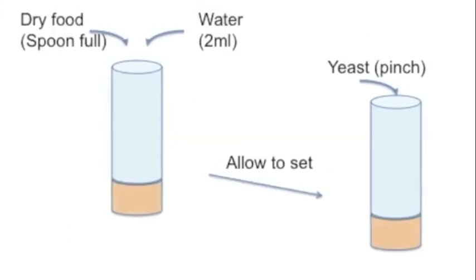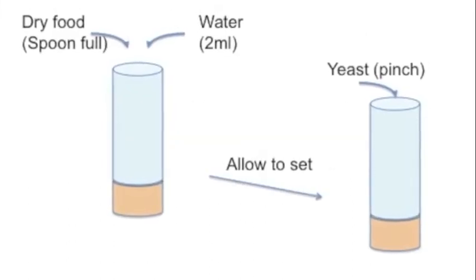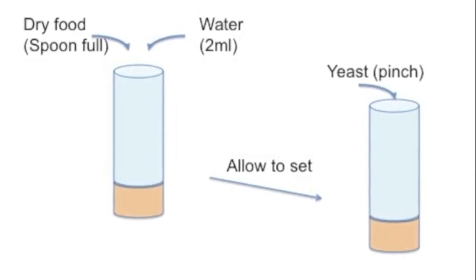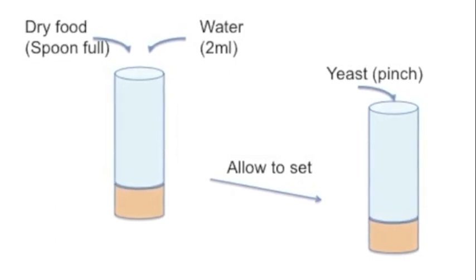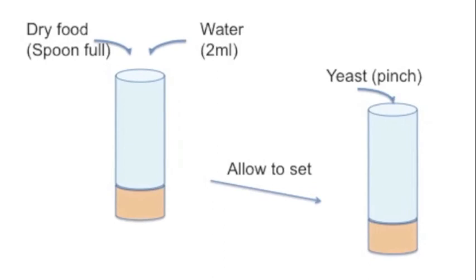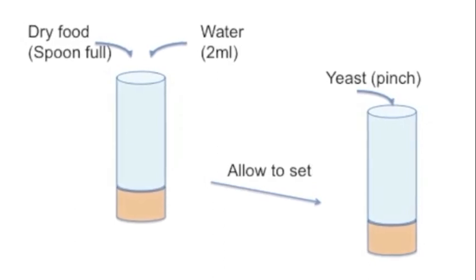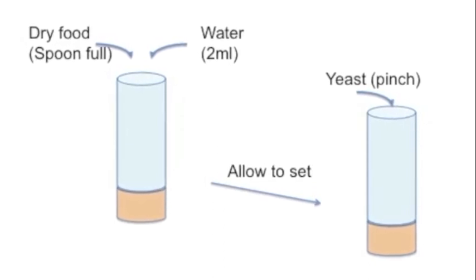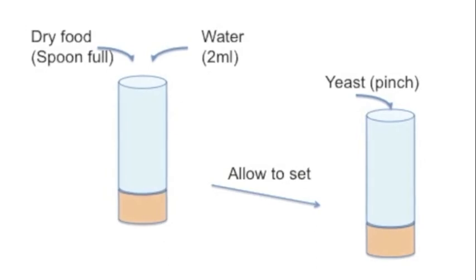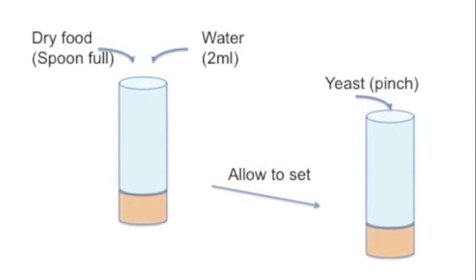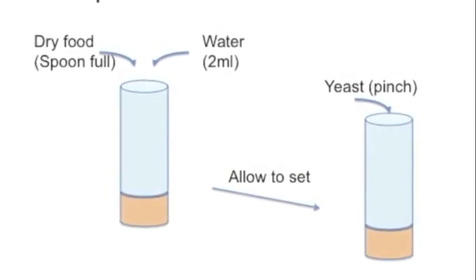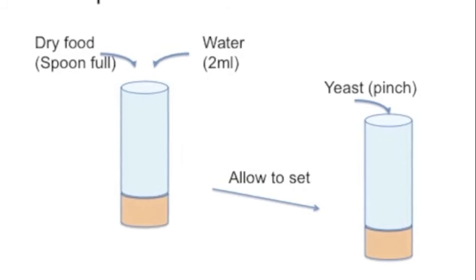Prepare the tubes where you will grow the flies. You will have to spoon some food into the tube, add some water, and mix quickly without getting the sides of the wall wet. Allow that to set, then add a little bit of yeast. The yeast is necessary for the larvae to grow.